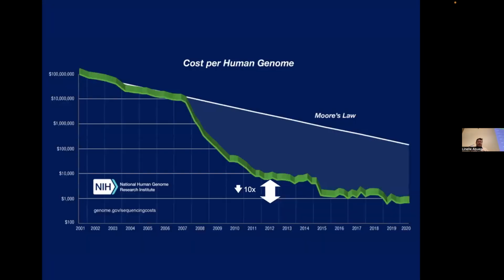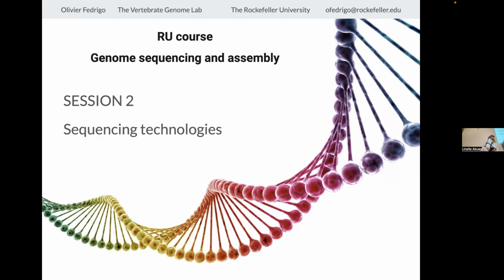All right. So this is a 96-well plate where you put your Sanger reaction in each well, so you can sequence 96 sequences at the same time. That looks ridiculous compared to what we can do nowadays. And these are capillaries. There are needles that go into the wells.